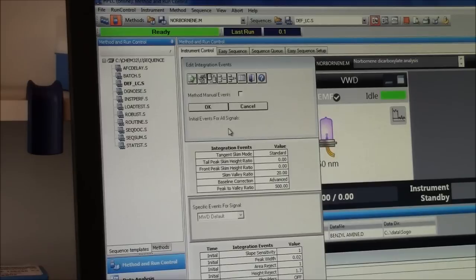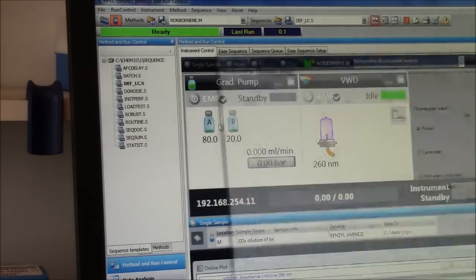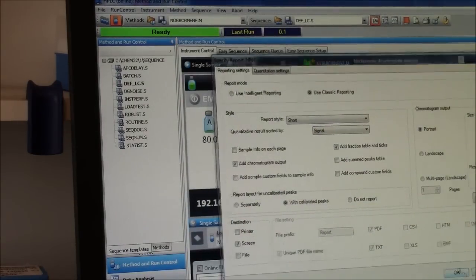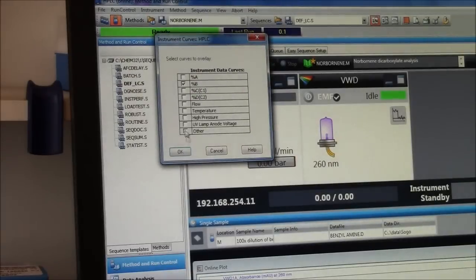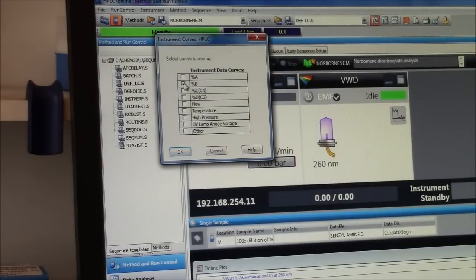This will come up, but just say okay. Right now, it has percent B.